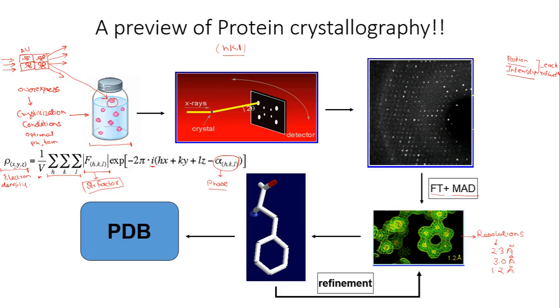So you say that if I observe such electron density in my electron density map, then this might be any amino acid residue which has a cyclic structure. And which amino acid residues contain an aromatic side chain?